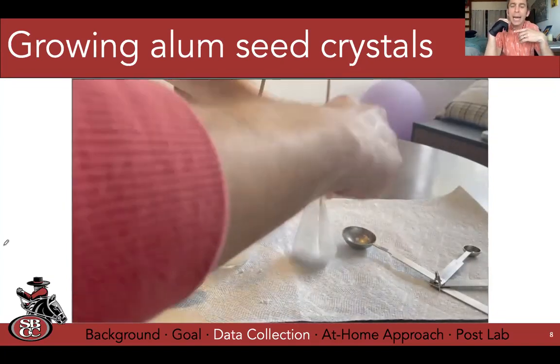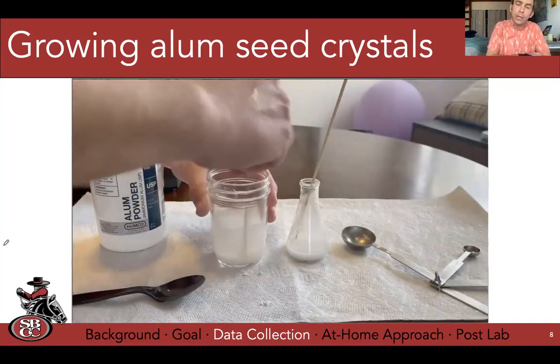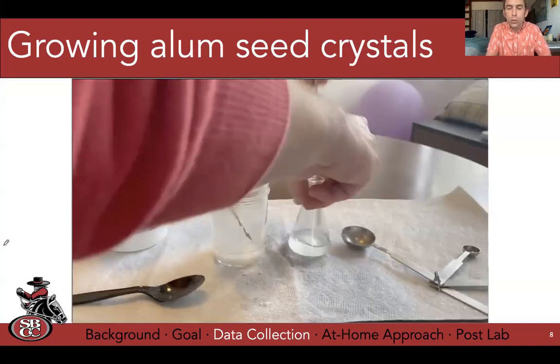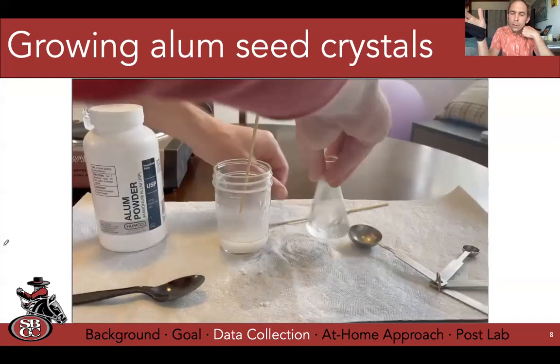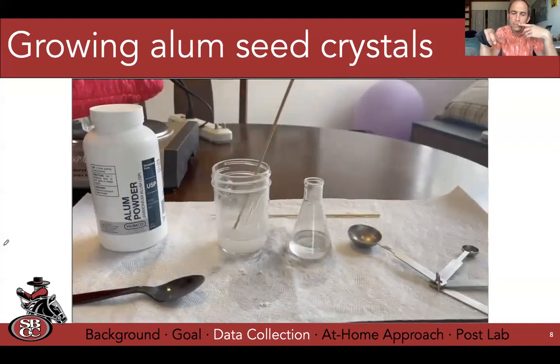That means that I haven't added so much water that I'm past the solubility point, even at the high temperature. And so now that I have these milky solutions, the name of the game is slowly adding until it goes clear. So of course, my Erlenmeyer flask went clear sooner because I only put 2 plastic spoons of alum.